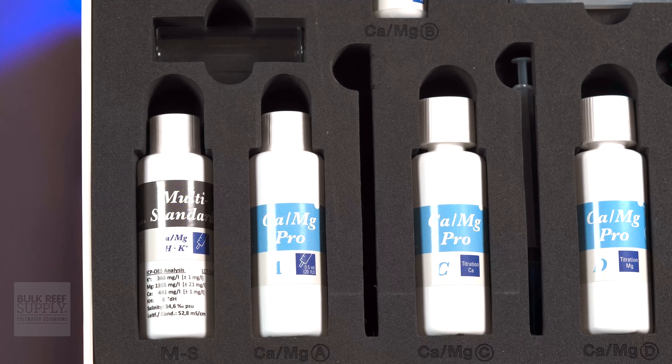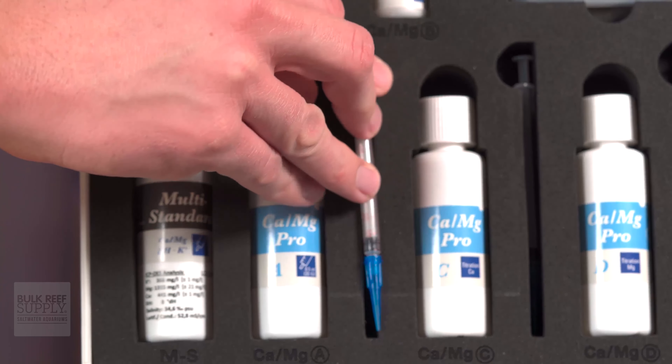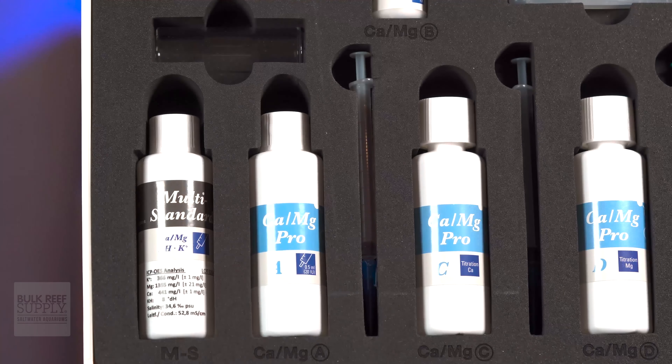Another cool thing — these syringes come with the tips already installed on them and they don't have to go anywhere after that. They can always stay on the syringe, because when you're done with the test, you can put the syringe with tip back into its place in the case. That way you're never wondering which is which. The organization gods are pleased.